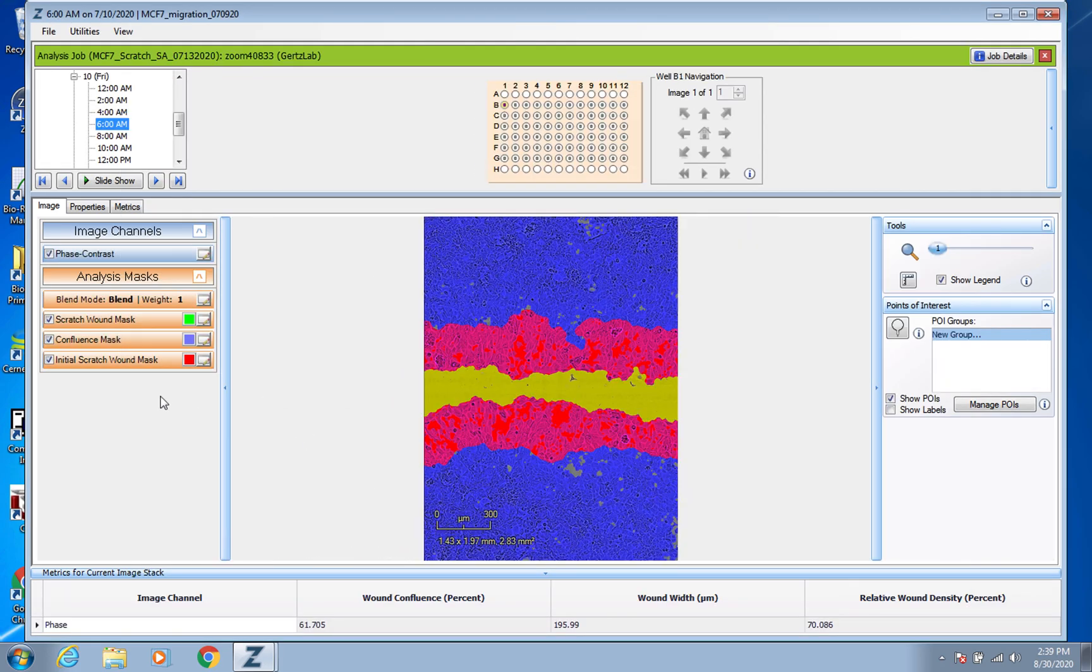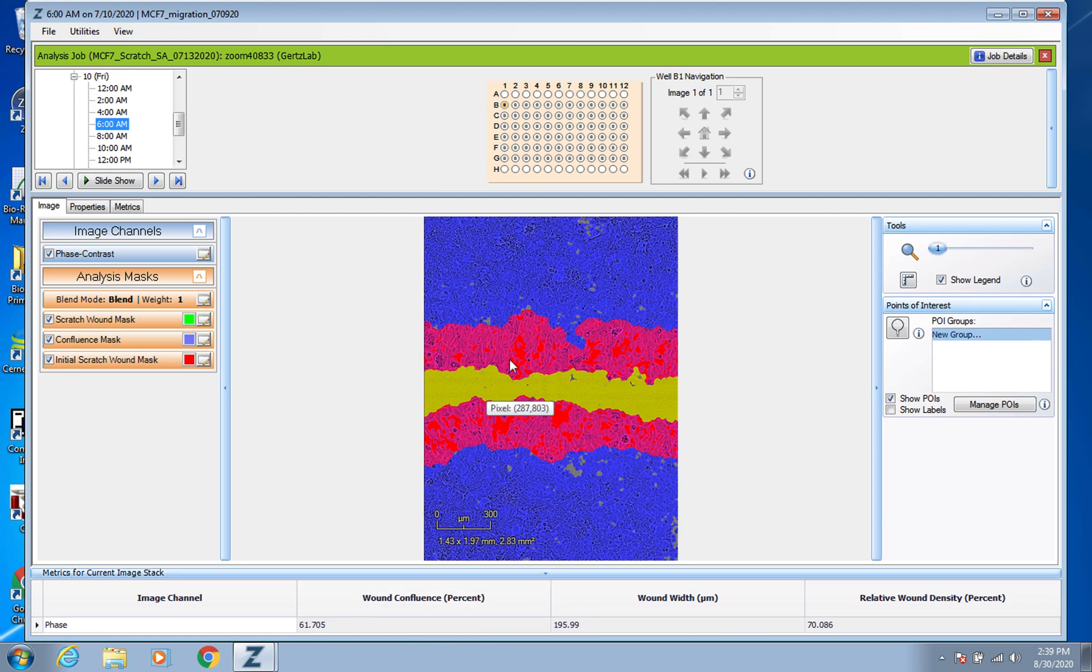So but I'm going to go ahead and cancel that of course. And now for getting your actual data, that wound confluence percent, so you're wanting to monitor the percentage that the original wound is becoming confluent over time.